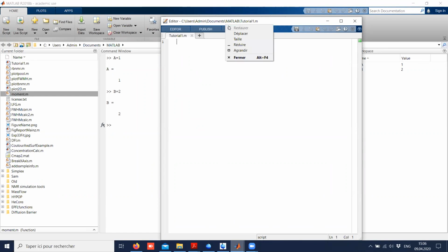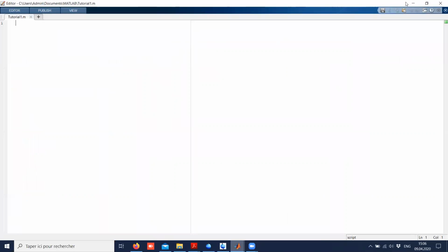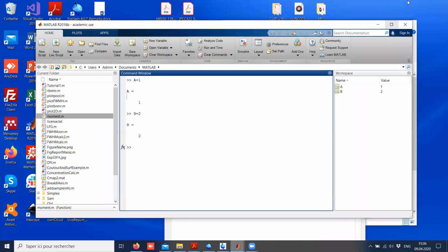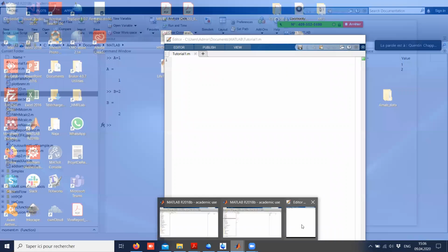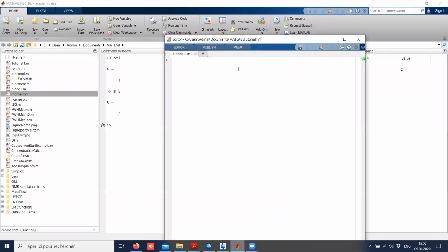And so that it's clearer, I will ask it to be, how do I do this? I did it the other day, I wanted to show you in fact, and now I don't succeed. There's a way.